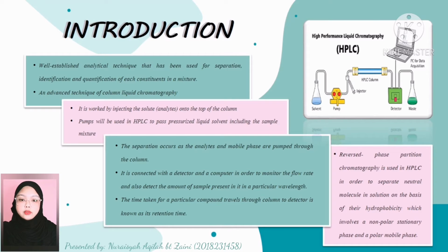Reverse phase partition chromatography is the most popular chromatography mode used in HPLC in order to separate neutral molecules in solution on the basis of hydrophobicity, which involves a non-polar stationary phase and a polar mobile phase.